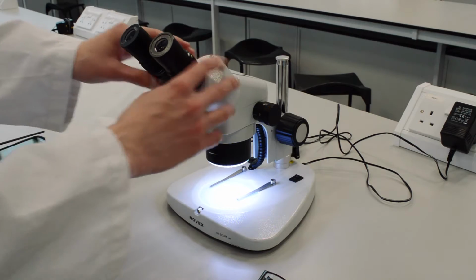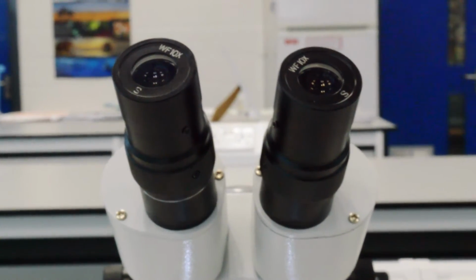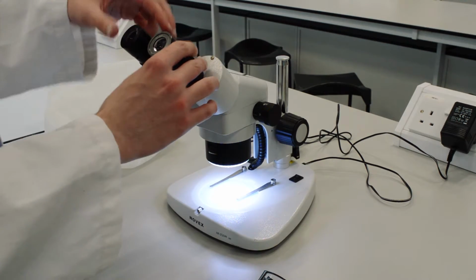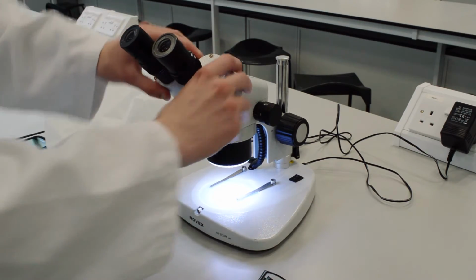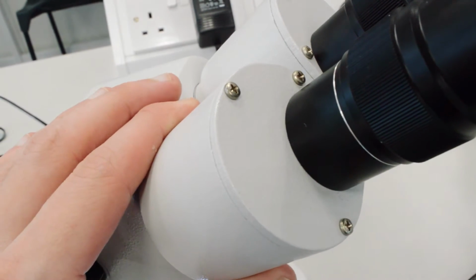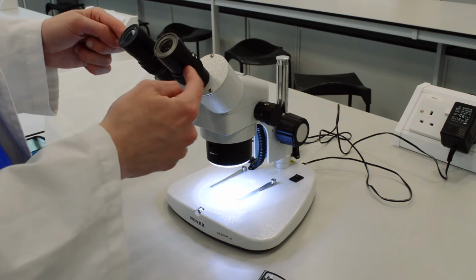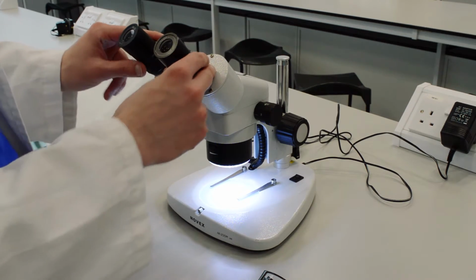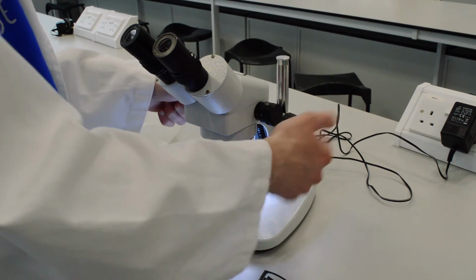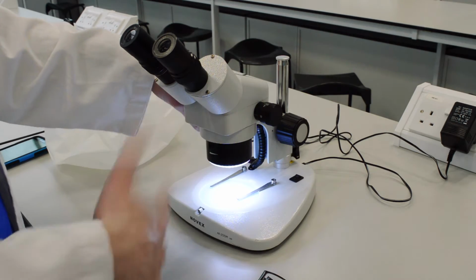And then at the top here you have your eyepiece. You may either have one or two eyepieces depending. In this circumstance we have two eyepieces that do 10 times magnification. You can turn around the base of the eyepieces on this model, and then you can turn the actual eyepiece itself. This is what you actually physically look through in order to see your organism. And what's always a good idea is to look through the eyepiece and then look at your adjustment knob so you can get a better idea on if your organism is becoming clearer or less clear.